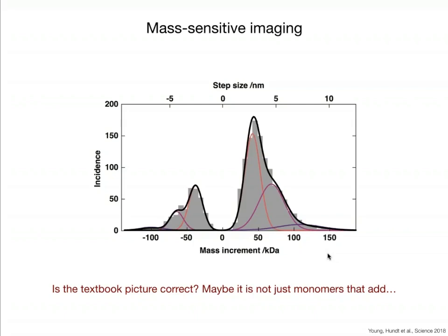You will also record 2 consecutive attachment events within a single frame. But to a certain extent, this also shows that there are dimers and trimers attaching to the actin filament tip, which is feasible if you consider that there are dimers and trimers present in solution, as we've seen in the nucleation experiments before.